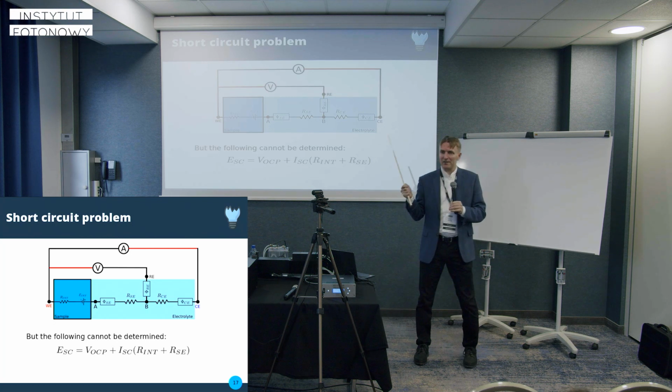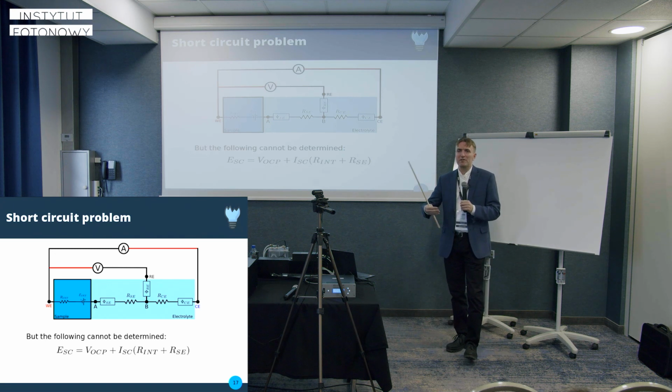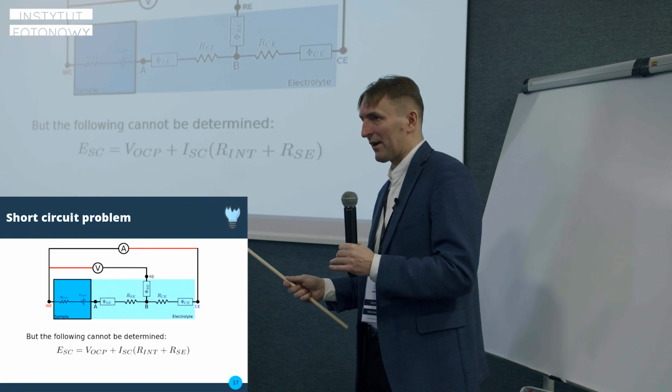We inserted it into the electrolyte, and this is why those additional potentials developed, and additional serial resistance.